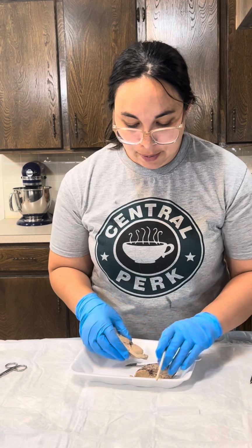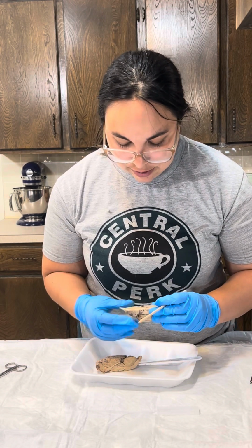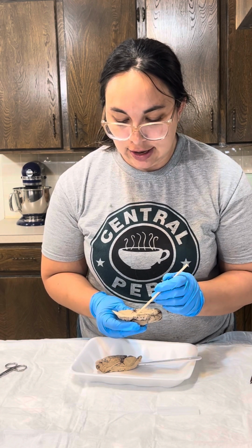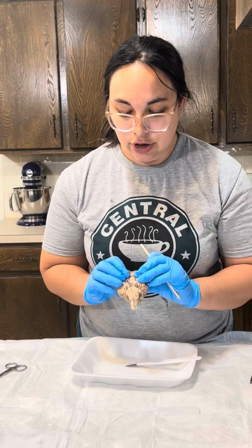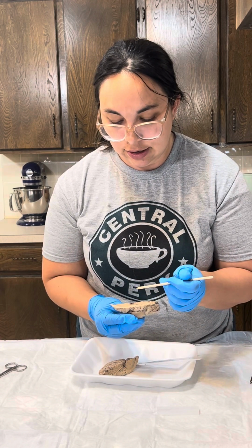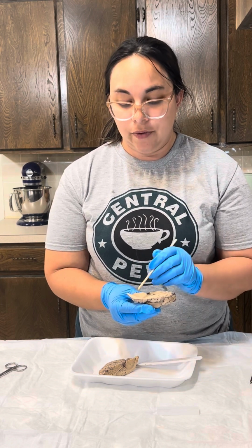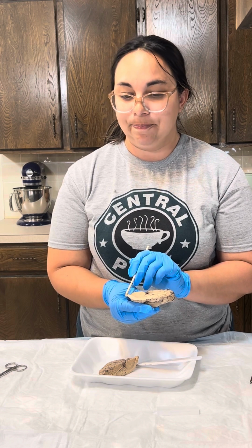So then the other part we're going to look at, let's see which one's better for this. We're going to do this one. You can still see the midbrain, and then the brain stem goes right into your brain. We've got the pons right here, and then we've got the medulla oblongata, and then we've got the spinal cord.